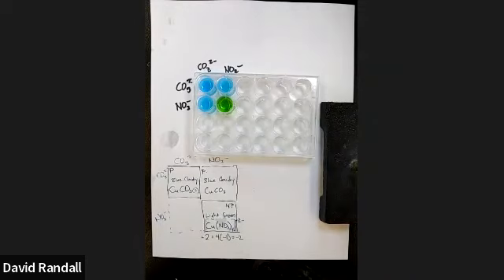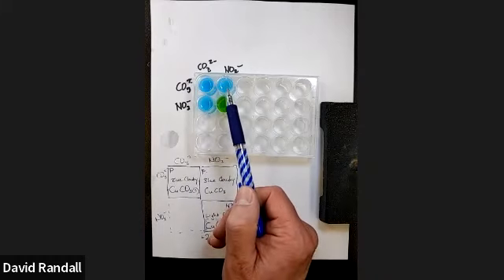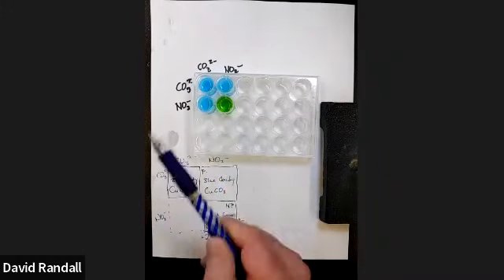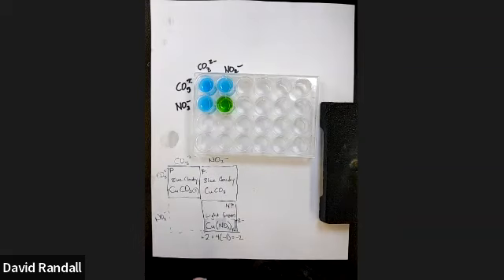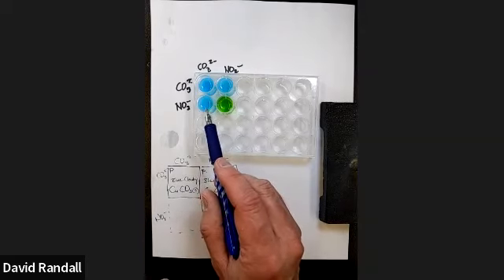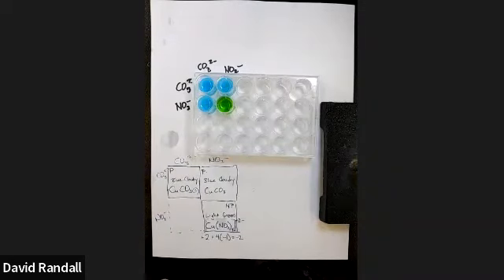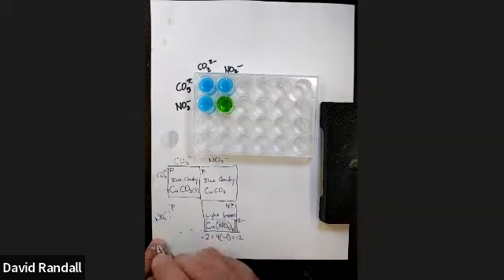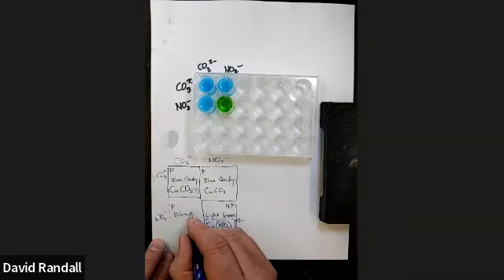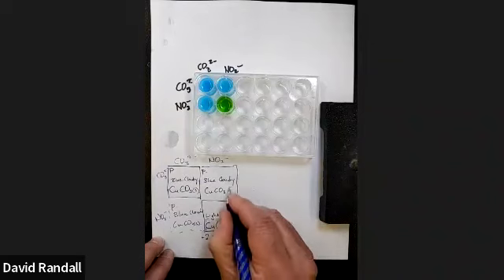So now it's very clear to me after I stirred it, this well here looks like this well here, and it looks like this one here. This just demonstrates that the order in which we add the compounds, the potential ligands, doesn't matter. So the results from here are the same as the results from this. We also learned it's very important to stir. So don't forget to stir. This is our general chemistry motto. And so this one was blue cloudy, and it was copper carbonate solid.